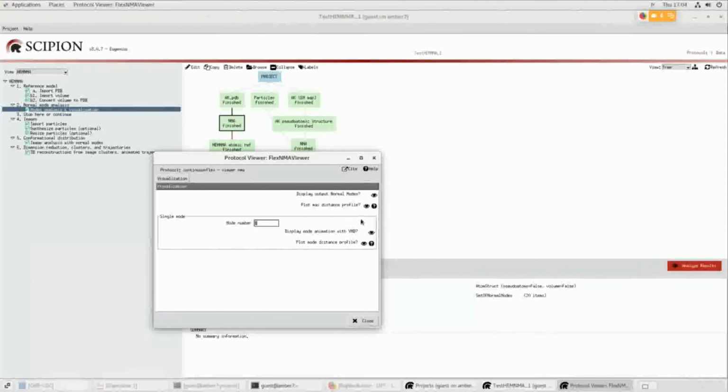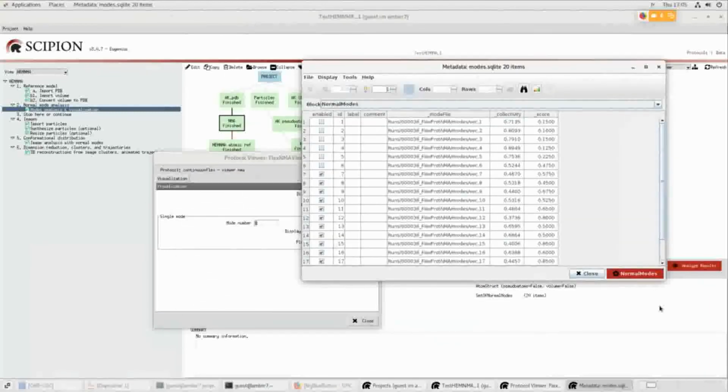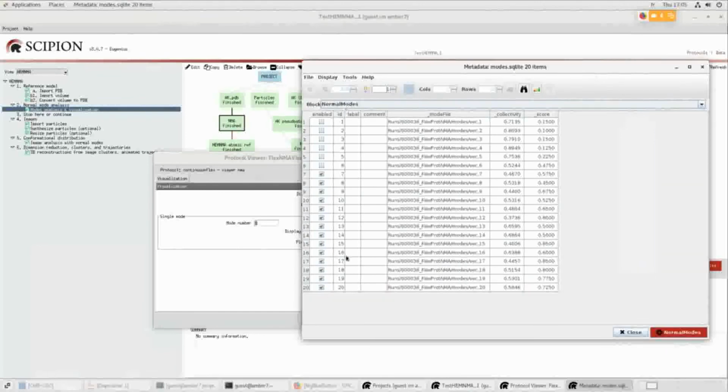So everything is fine with our cutoff parameter for the interaction of atoms. And then you get the list of modes. As I said, we computed only 20, so we also computed these 6, but actually they are not checked in order to tell the user that they should not be used.